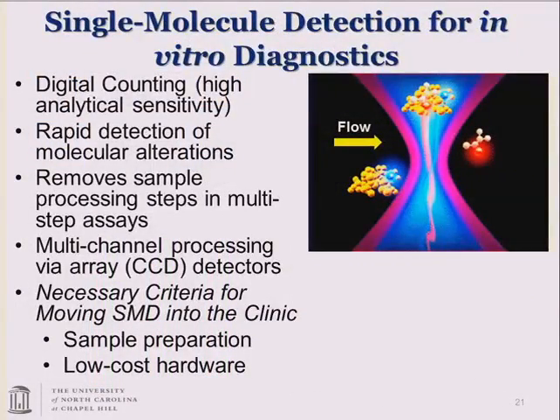All right, so the last thing that I wanted to mention here, and I'll have to do this a little bit quickly, is reading single molecule fluorescence on the back end. So remember what we have here. We have this ligase detection reaction, and we have this thermal reactor that's continuously generating products. Those are being fed into the detector online. So we're not doing a batch measurement, we're doing an online measurement. And the one thing that I want you to take home is two things. We're doing digital, molecular counting, and we're eliminating the need for processing steps because of the sensitivity that's developed through the use of single molecule detection.